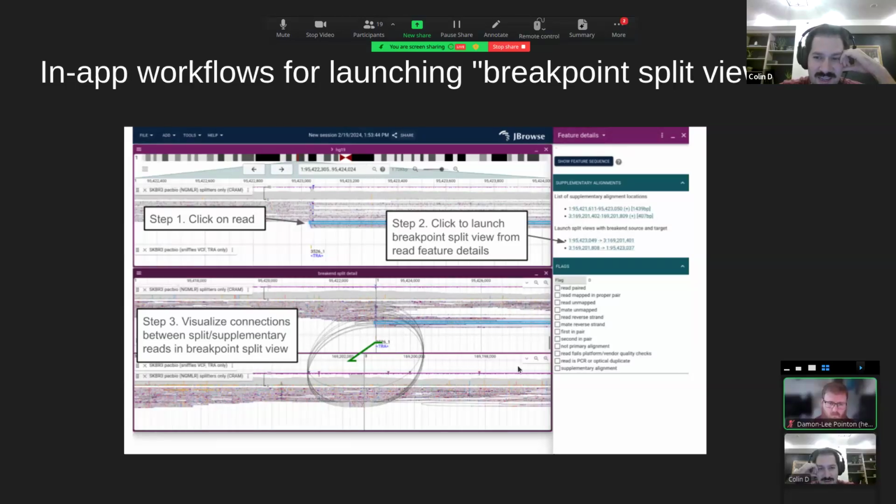Someone mentioned that they would like to have something like this for Synteny views. So I am continuing to brainstorm things like that, because I think this plays into the types of integrations that could be created, like dynamically launching a new panel or re-navigating an existing panel to a new place. Sometimes that's what you want to do.